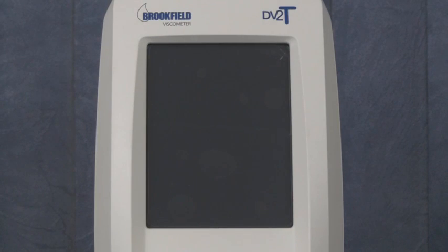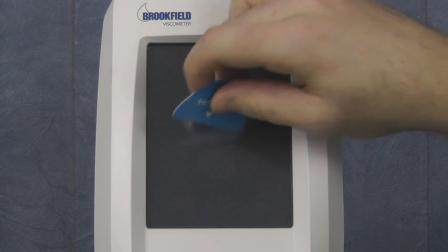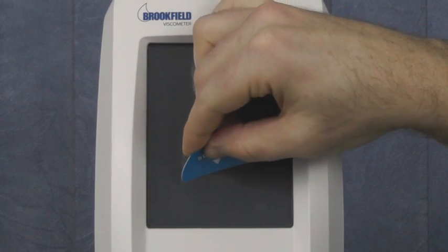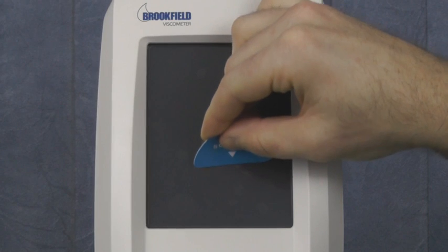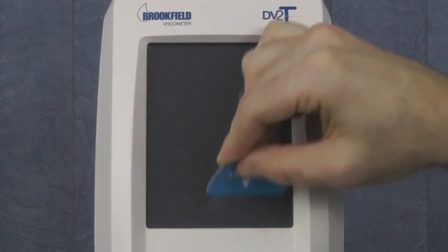Once the screen protector is applied, you will most likely see air bubbles trapped between the protector and the screen. Use the provided soft card to push trapped air bubbles from the center of the screen to the edge. Small bubbles should go away within 48 hours.